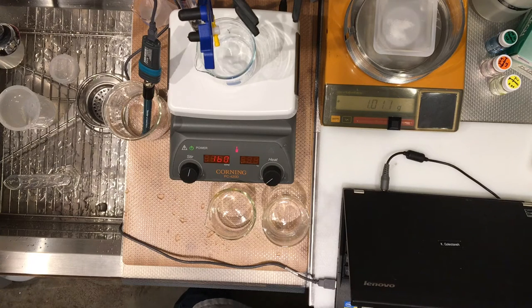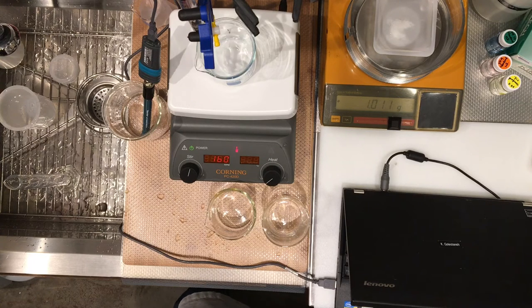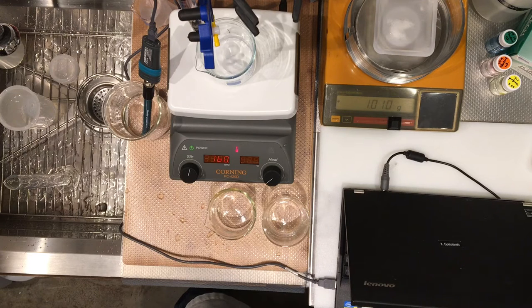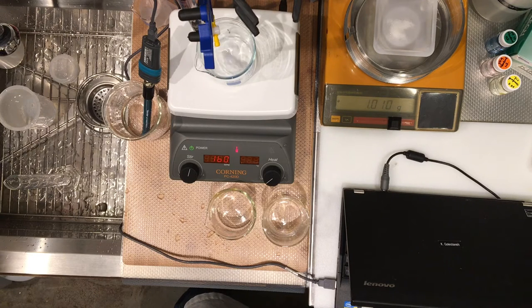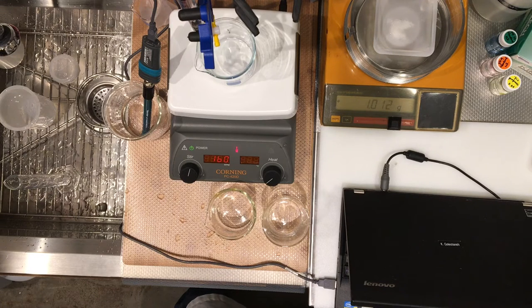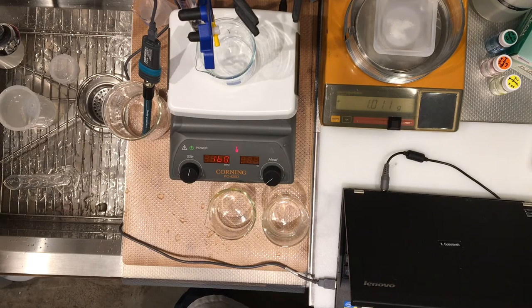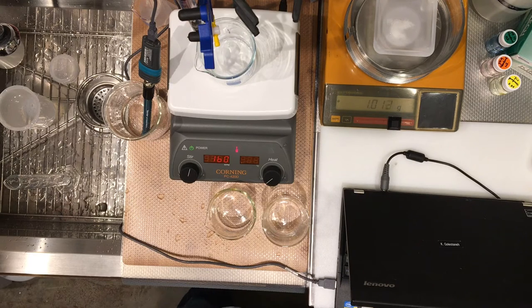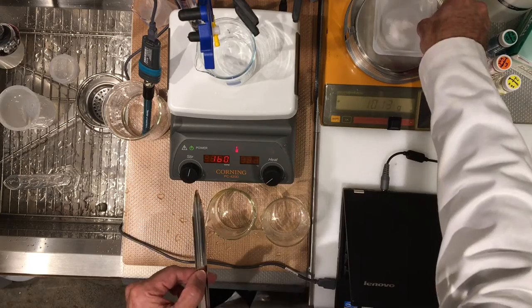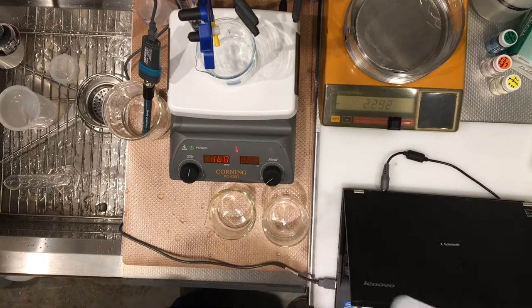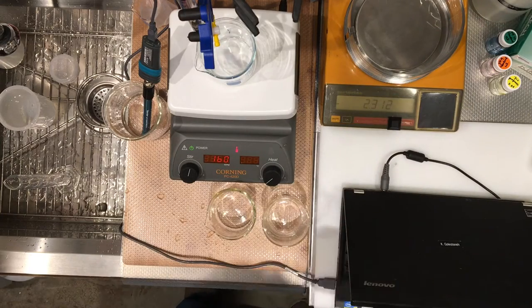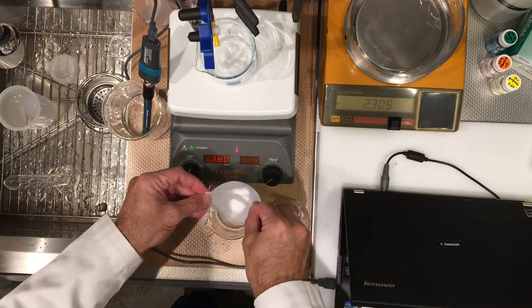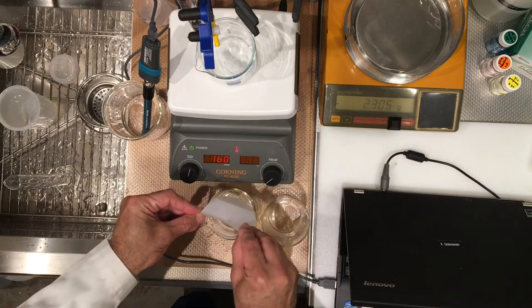Okay, we have 1.011 grams, transferring this to beaker number two.